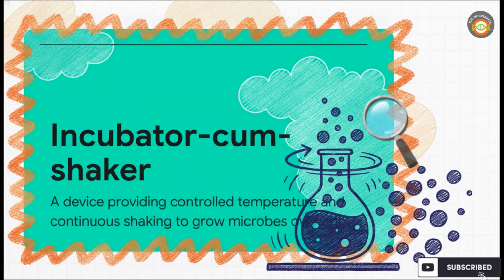Now, what's really interesting here is the specific device she uses. It's called an incubator-cum-shaker. Because honestly, it's not enough to just let the samples sit on a desk somewhere. This machine does 2 absolutely crucial things simultaneously. It maintains a perfectly controlled warm temperature, and it continuously shakes the flask. Giving it this constant physical agitation overnight is what allows those few invisible bacteria hidden in the soil to rapidly multiply into a dense, workable liquid sample that scientists can actually use.